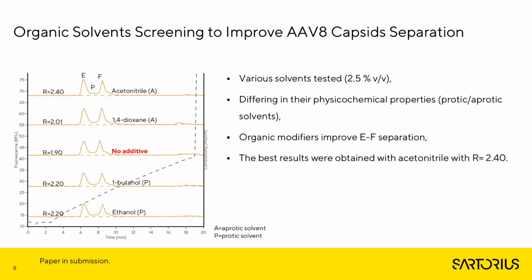First, we performed various organic solvent screening. The concentration of the solvents was 2.5% in the loading buffer, and these various organic solvents differ in their physicochemical properties.